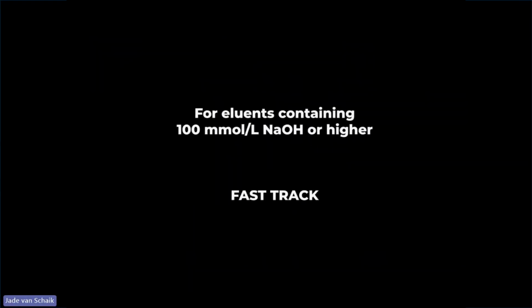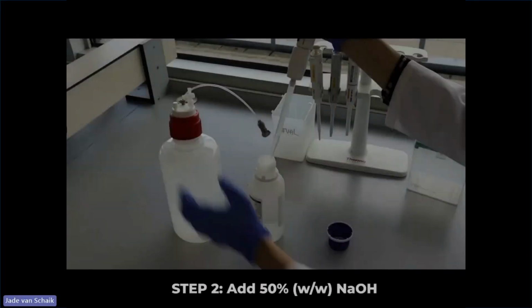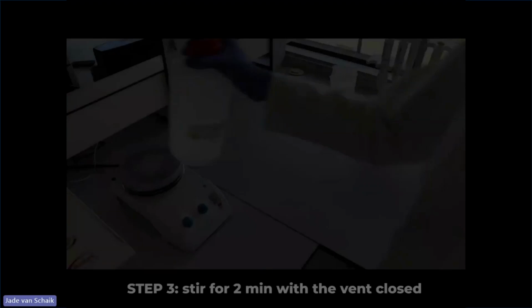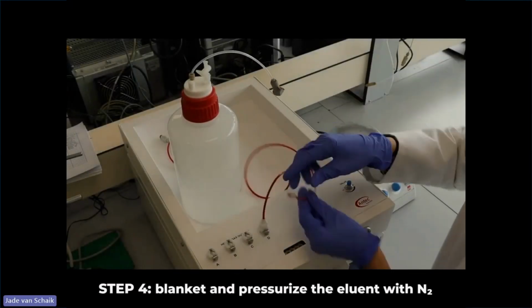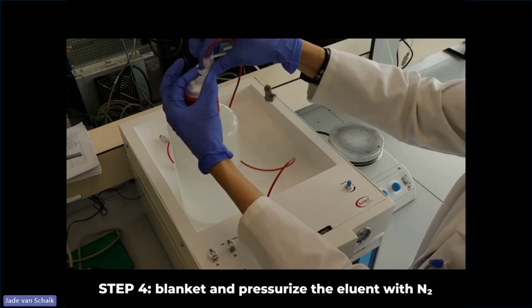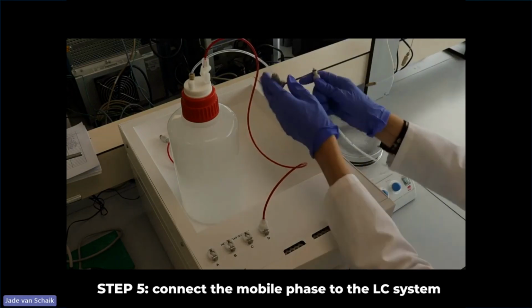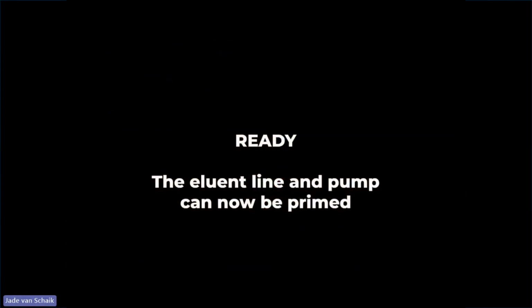For preparation of stronger eluents, a fast track is available. We start with drawing water, then add the sodium hydroxide with the vent closed. Stir the solution for 2 minutes. Then attach the red gas line to the cap to blanket the eluent. Make sure the vent is opened and connect the eluent to the system. It is ready for priming.